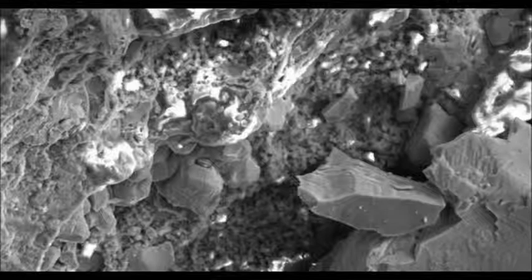The result is a series of what are called X-ray maps, pictures of the same sample showing the presence and quantity of different elements. It is this understanding of the minerals at a microscopic level that goes far beyond simply telling us what the meteorite is made of, said Simon Burgess of Oxford Instruments, which made the X-Max silicon drift detector used by the team. For the researchers who are looking at this meteorite, it's going to be telling them information about which mineral phase is associated with which, he told BBC News.